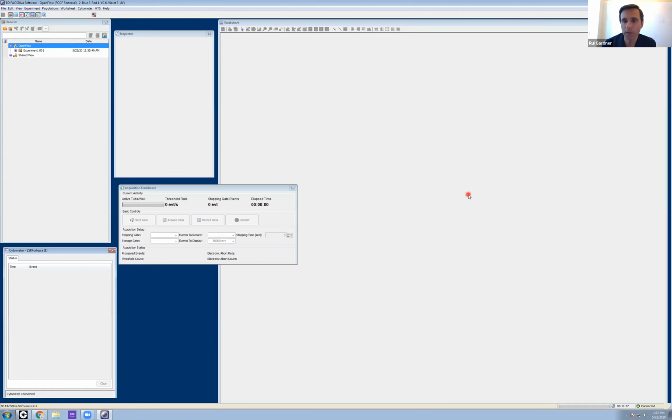Let me see. There are a few questions here also. All right, so this is regarding the lot number. There are actually a few questions here on how these different lots differ, and also what they are about, right? So I basically answered already what the idea of the different lots is. They have different target values, and so basically that's used for the software to know if these target values are being reached or not as a performance measure.